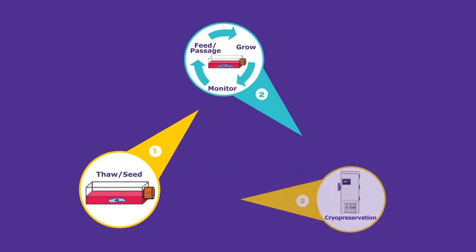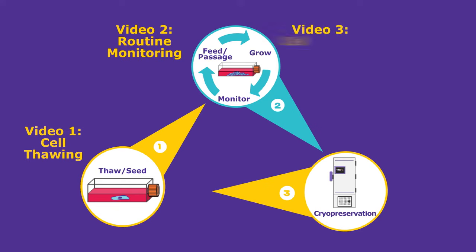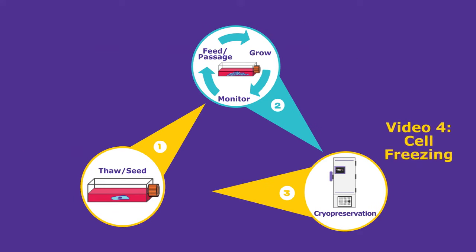Today's video is part of the video series covering 4 key components of tissue culturing. Today we'll cover cell freezing, which is actually a very important foundational part of any cell-based research.